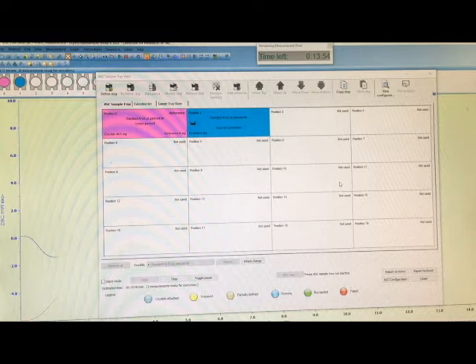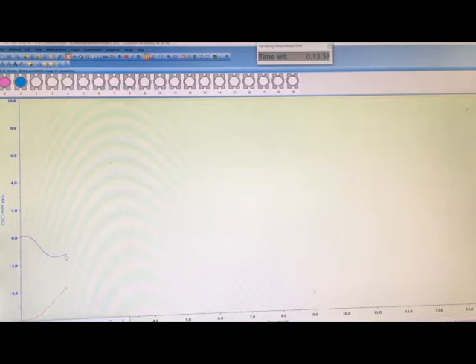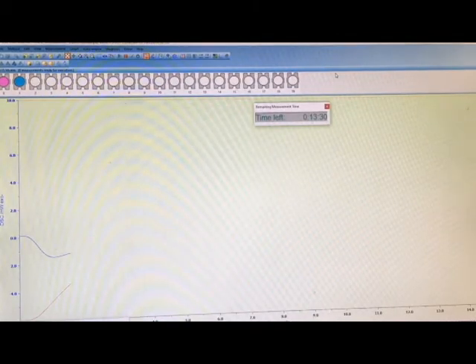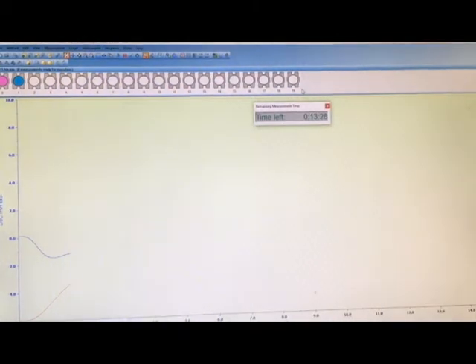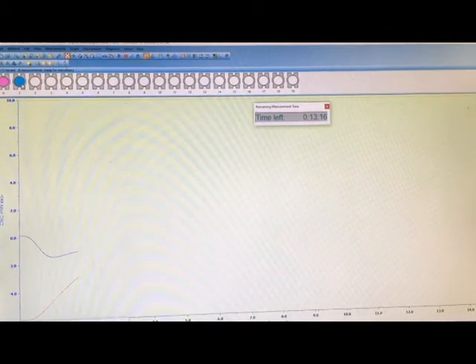While the test is running, you can close or minimize the auto sample tray view and see the data collecting in real time. The red line shows the temperature of the instrument and the blue line shows the DSC response. Up in the top you'll see a timer for how long the current test will take. As the various auto sampler tests finish, you'll see color changes along the auto sample tray — blue means actively running, and it will turn green once it is finished.